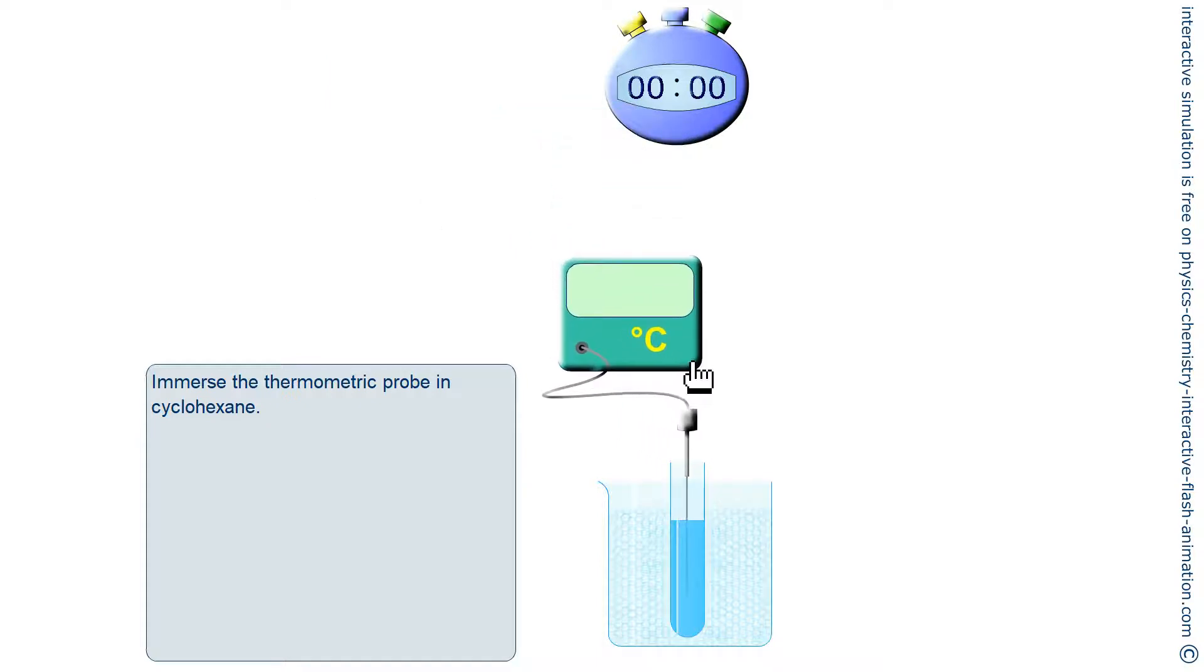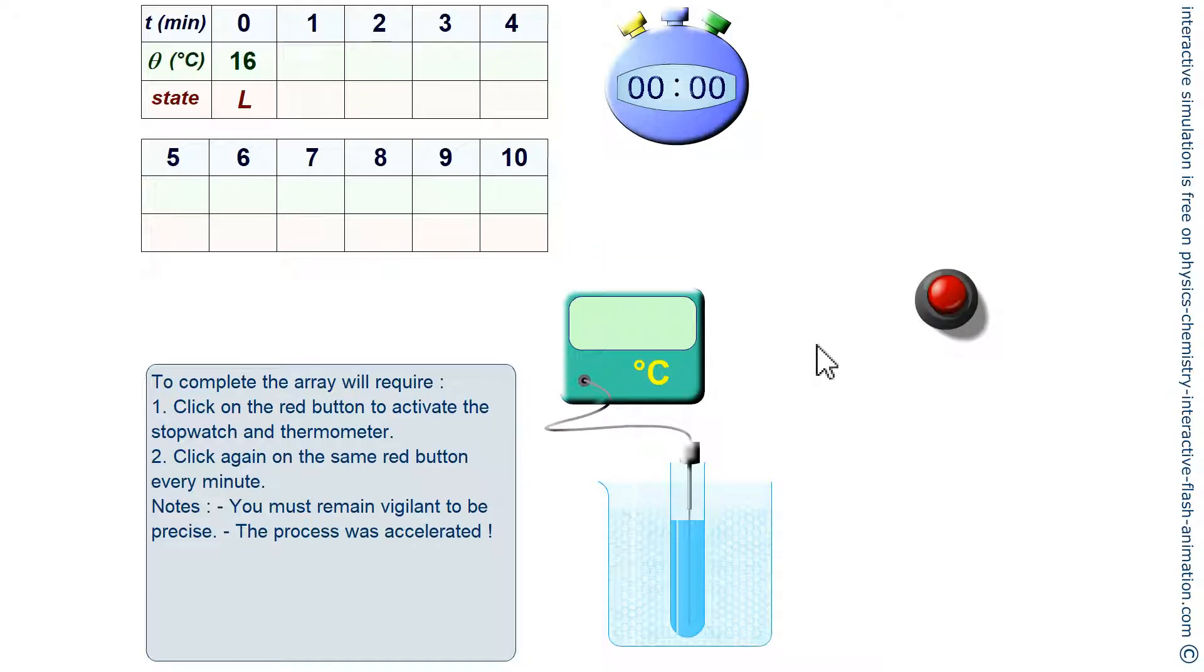We will measure the temperature with a thermometric probe, keeping an eye on the stopwatch during the change of state. From time to time, I will interrupt the recording so that the video is not too long.